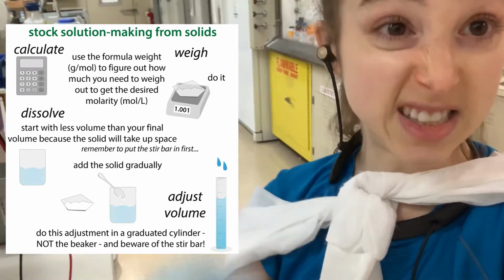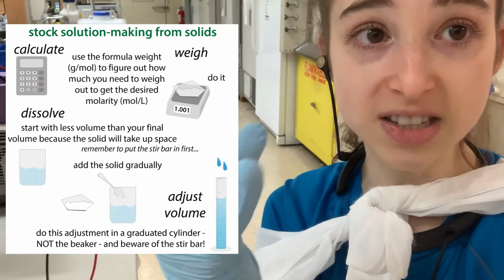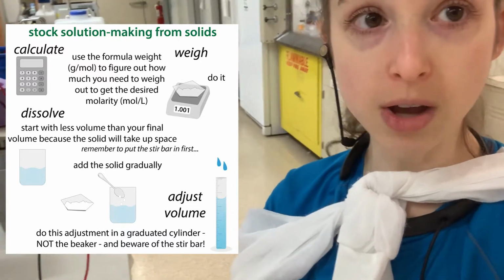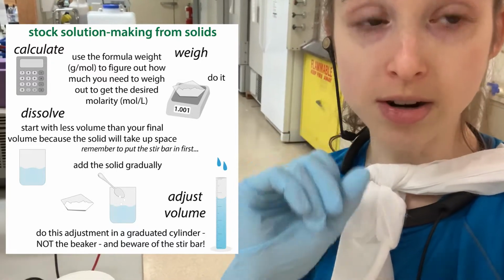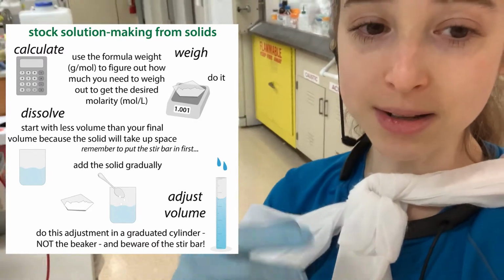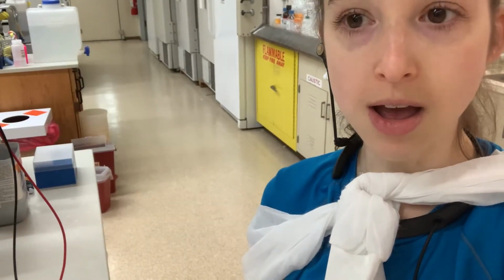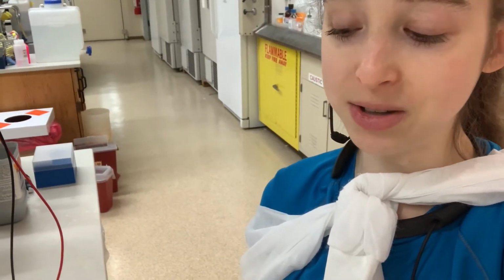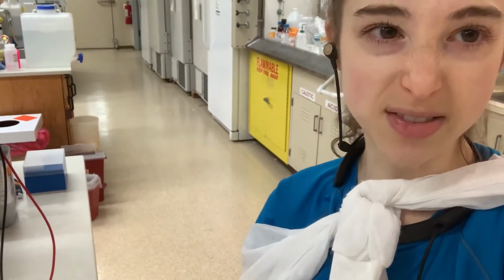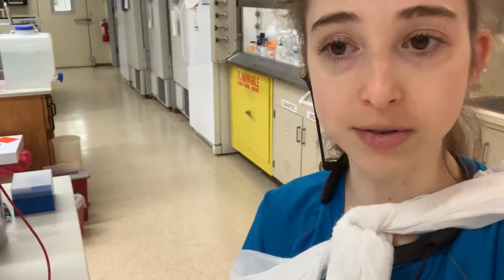You don't want to just stick the solid in and then pour the liquid on top, or else the solid's going to clump up, and it's going to be really hard to mix. So you have your liquid. Make sure you put in the stir bar, the magnetic stir bar. Sometimes you might wonder, why isn't this stirring? And it's because you forgot to put in the stir bar. And if you put in the stir bar, but you have all your solid at the bottom, it's not going to really stir. So be careful about that. And also be careful of big chunks. So try to pound it up a little first if there are big chunks.